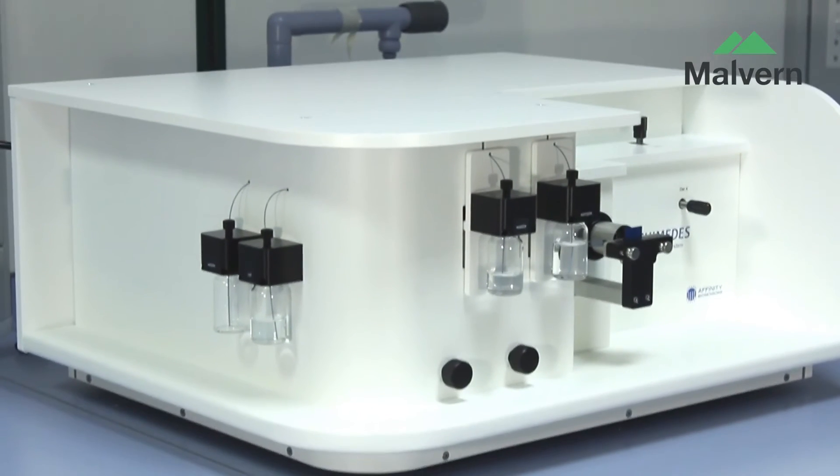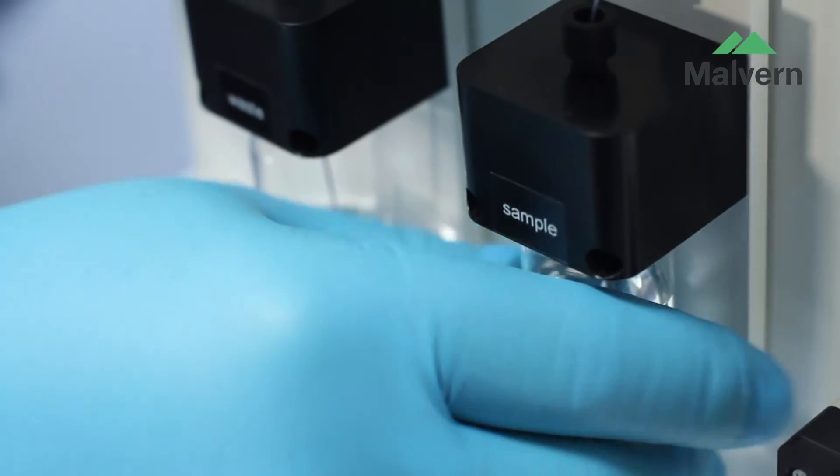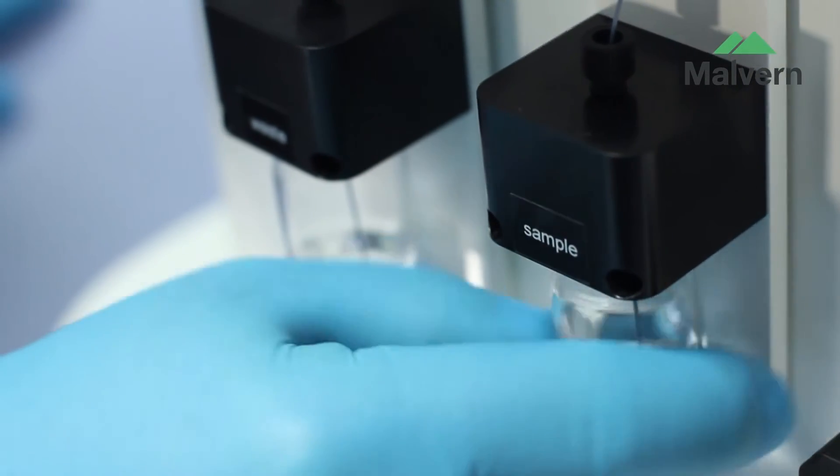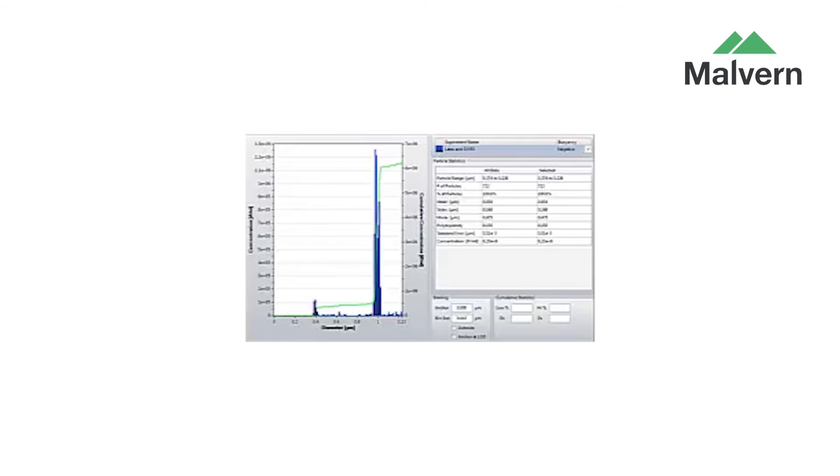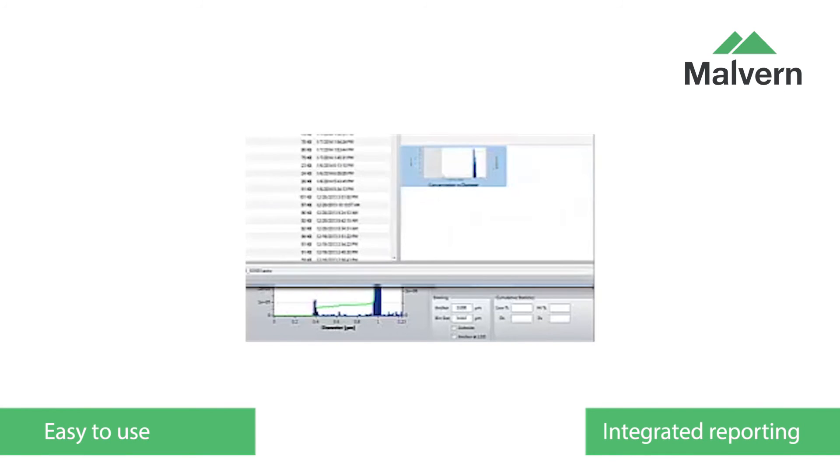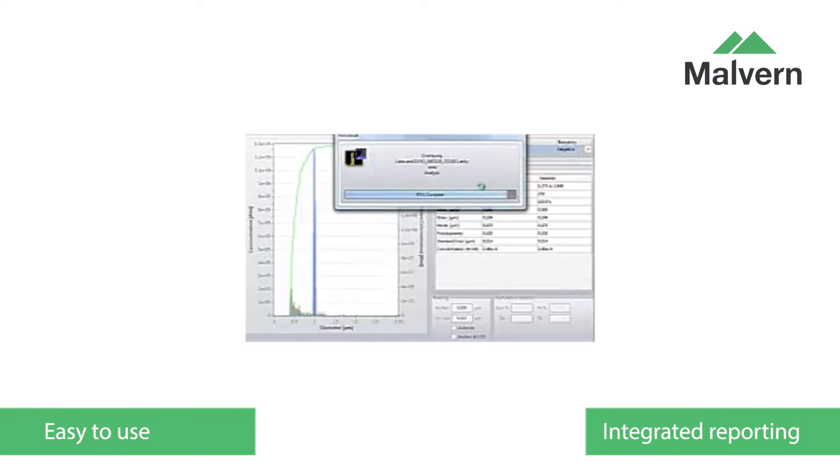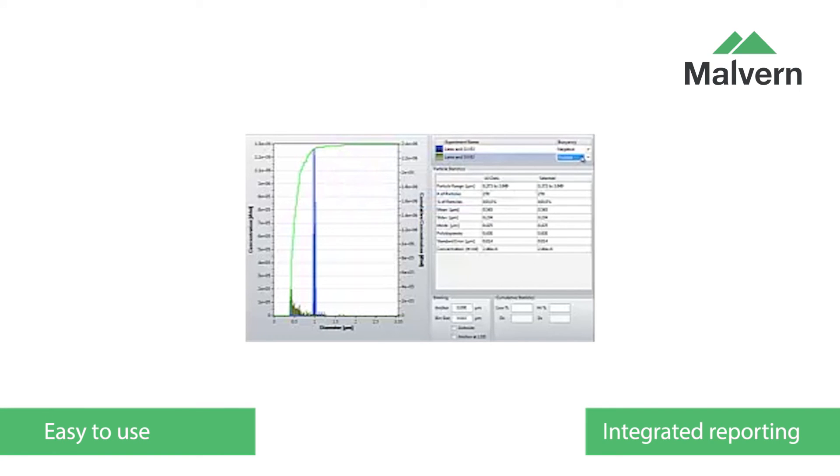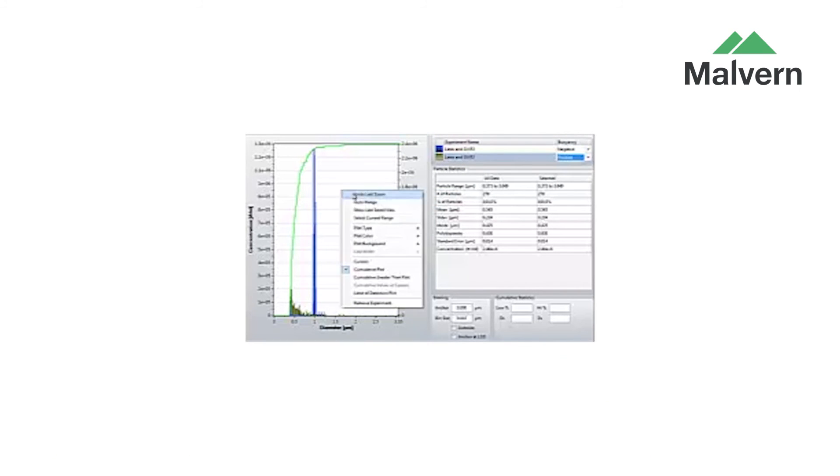Above all, Archimedes is easy to use with samples not normally requiring dilution or preparation before they're analyzed, and intuitive software which guides you through analysis and data collection and prepares templated reports to provide the exact information you need.